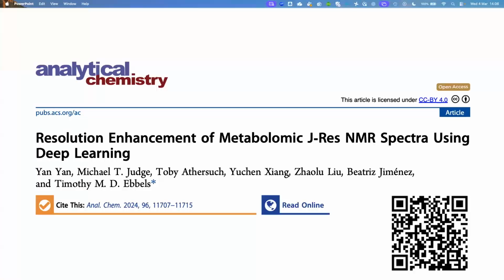Well, the short answer is the symmetry thing was a bit icing on the cake. The vanilla network, retrained, did pretty well on its own. Adding the symmetry part to the loss function, no matter how much we weighted it, never produced a huge amount of improvement, but it did produce an obvious improvement.